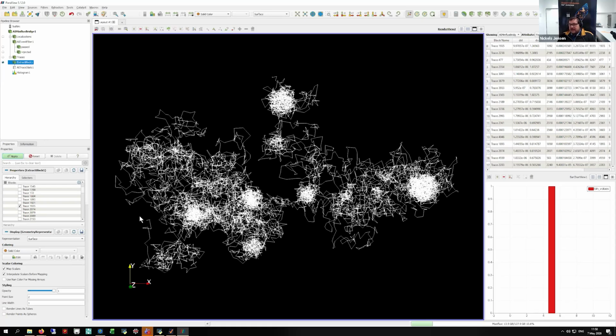This lipid is diffusing very freely, but at some point it gets stuck at positions, probably lipid rafts or something else. This is probably not visible if your time resolution is not right. If you would measure just every 100 or 1,000 time points with a camera-based system, you would not be able to see that they are stuck at specific positions.